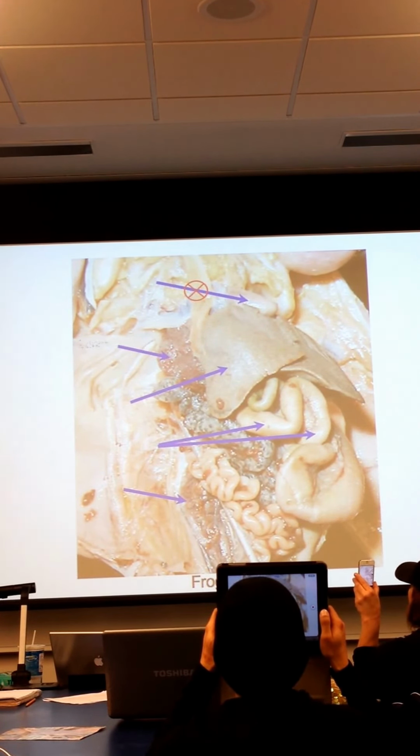The lungs. Excellent. What's this? The liver. What is this here? Large intestine. Small intestine. This is the ileum. Remember when I warned you guys that they would have a pin through the middle of the small intestine, but it would still be all blobbed up? That's the kind of thing they're going to do.